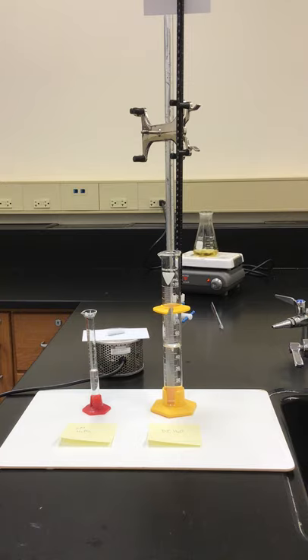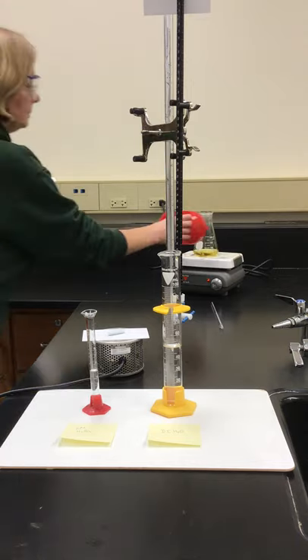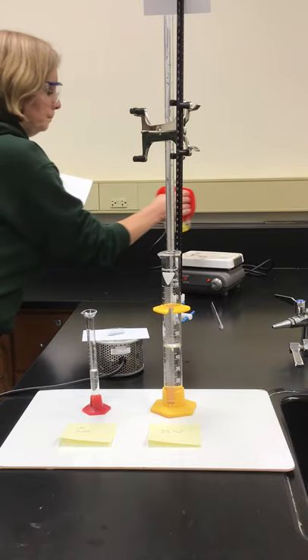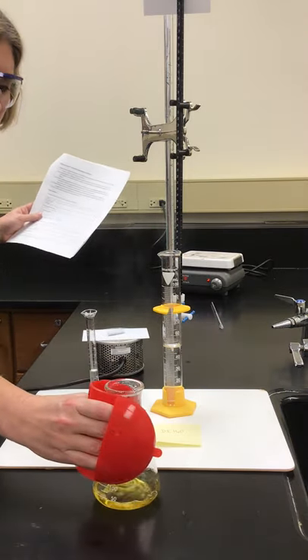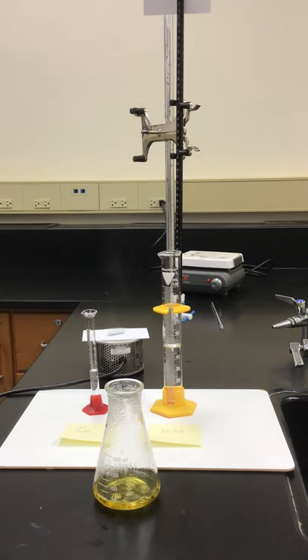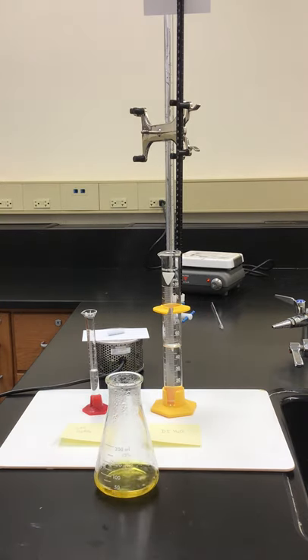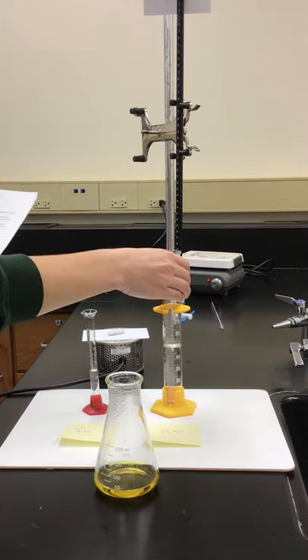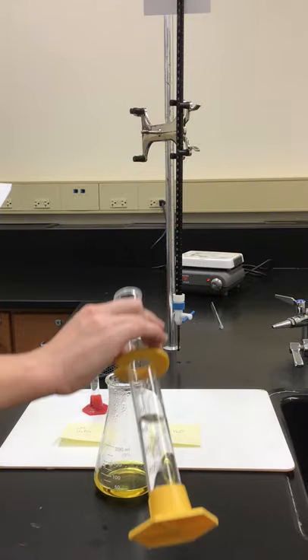We're going to then react that iron two ion with our standardized potassium permanganate. I'm going to take this off of the heat, set it here. Our directions say to take the product of the hydroxylamine and iron three reaction and add 50 milliliters worth of DI water. So that's what I have here.